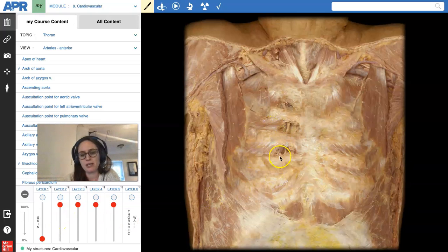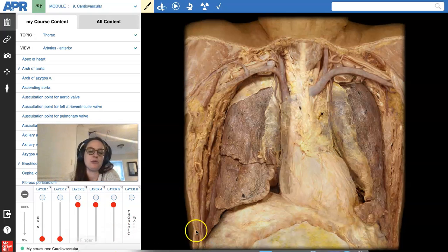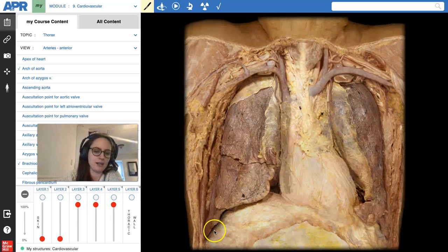From here we can appreciate the costals, the ribs. This is mostly costal cartilage that you're viewing right now. You can see some of our major muscles of the anterior thoracic region. We've cut away quite a bit. We skipped a few steps. One thing that we do is we cut away the ribs. We do that with some gardening shears. So there's a lot of trips to Home Depot involved in dissection lab, not gonna lie. Those small ones with the little clippy thing shaped like that are what's used to get rid of the rib cage.